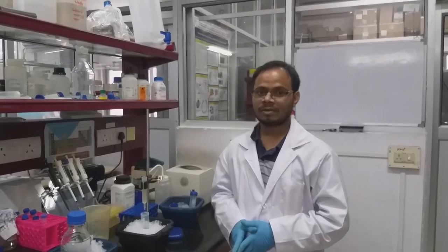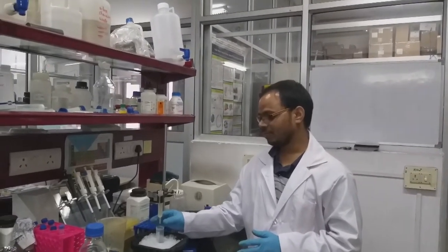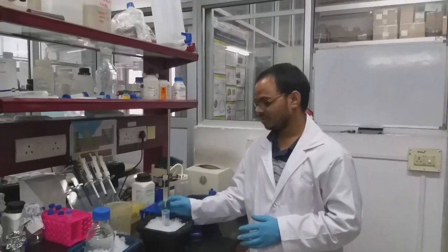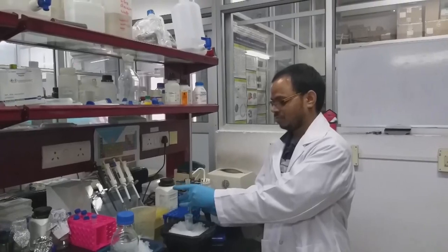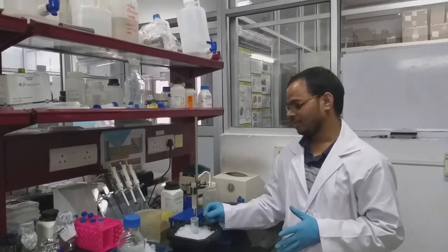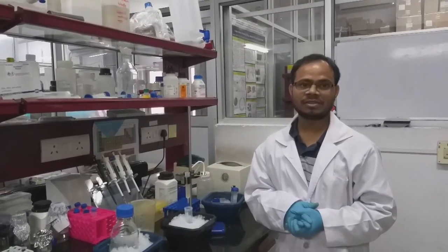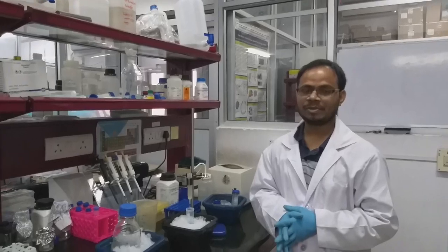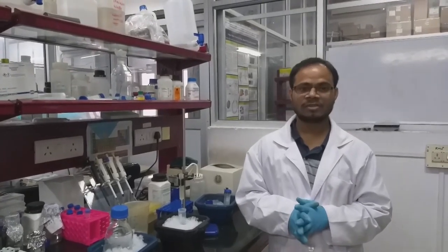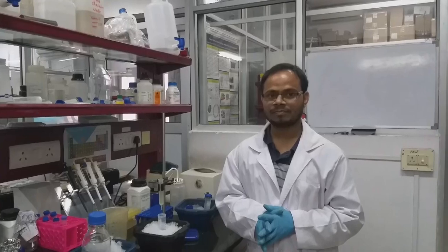After incubation with beads, we have to follow another 3 steps to get complete purification done. After the beads are taken out from ice, you have to remove the outlet so that all the flow through other than the beads will be taken out. First step is we have to wash with the equilibration buffer. And the third step is we have to elute the histagged protein using imidazole containing buffer.